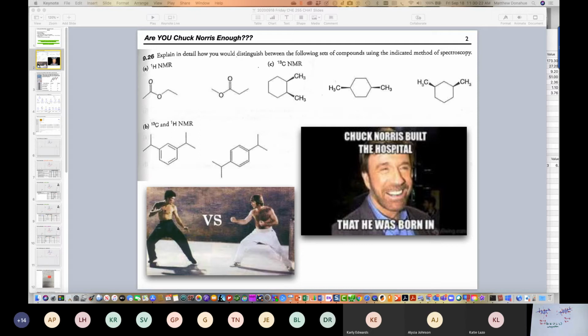So again, the value in this exercise is, like I've said before, many of you are not going to study organic chemistry. Only a few of you are probably going to go into biochemistry. But the value in these types of exercises is the empirical observation and learning how to think about solving problems. So we've reduced the carbon count to 4 unique types of carbon. How many unique types of hydrogens are there?